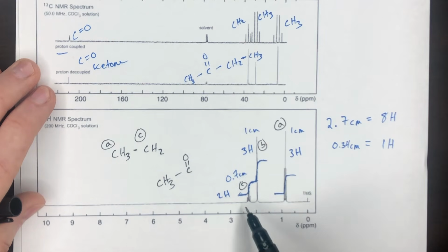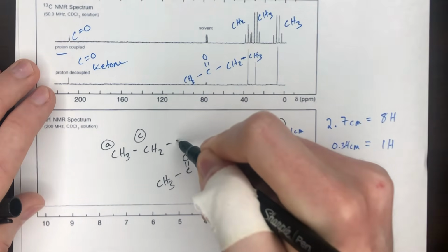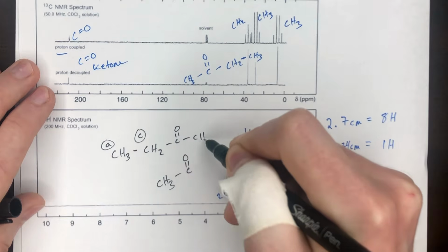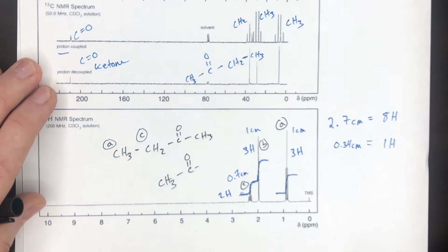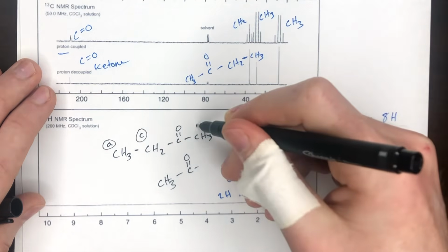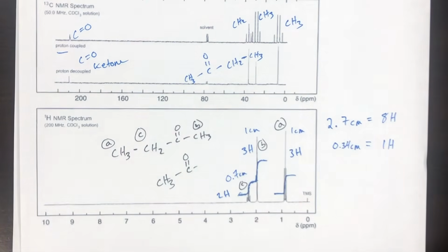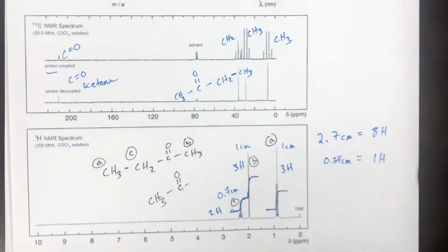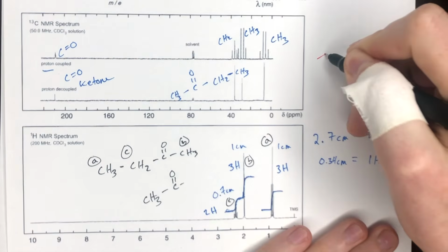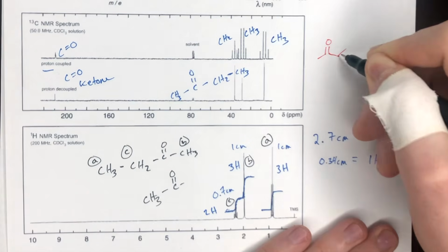And again, we see that this CH2 group is also shifted downfield slightly. And again, these are all additive, so this makes perfect sense that our structure would be like this, where we combine these 2 fragments together to get that. And now here, this is the B signal, those hydrogens. So now I will redraw this once more in a different color and in a skeletal format to show how you should include all this information on an exam to give you the maximum points.